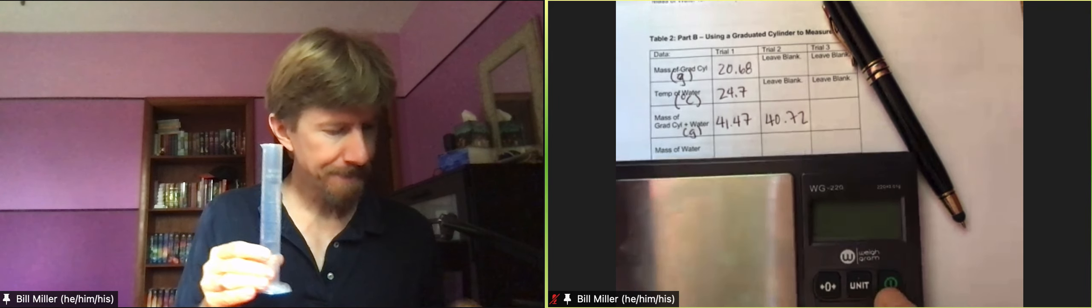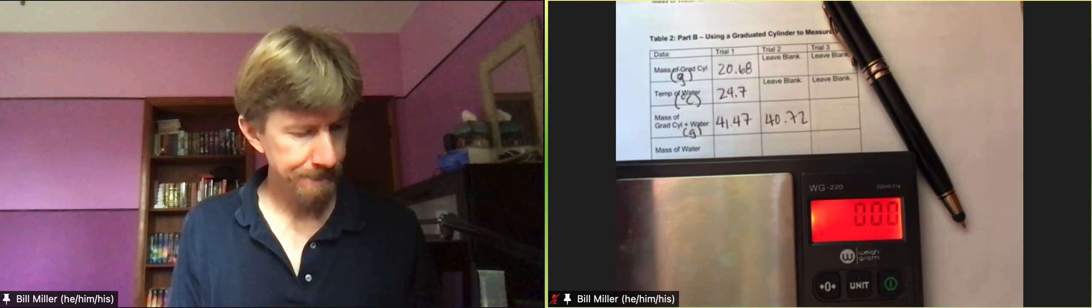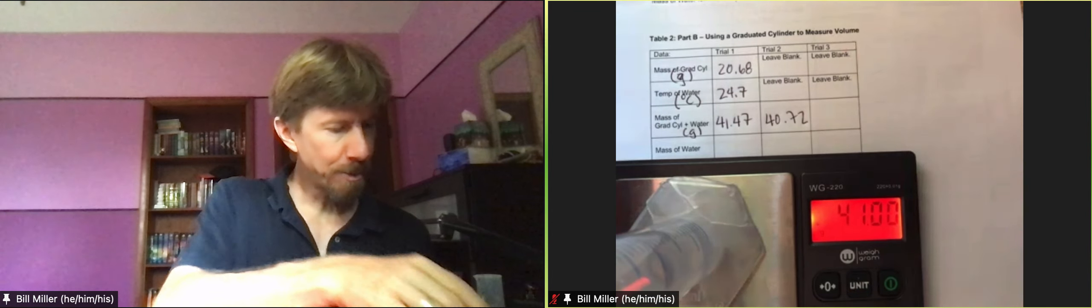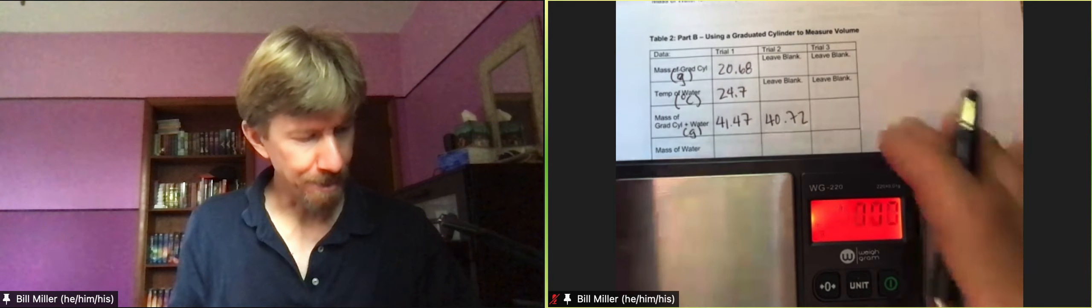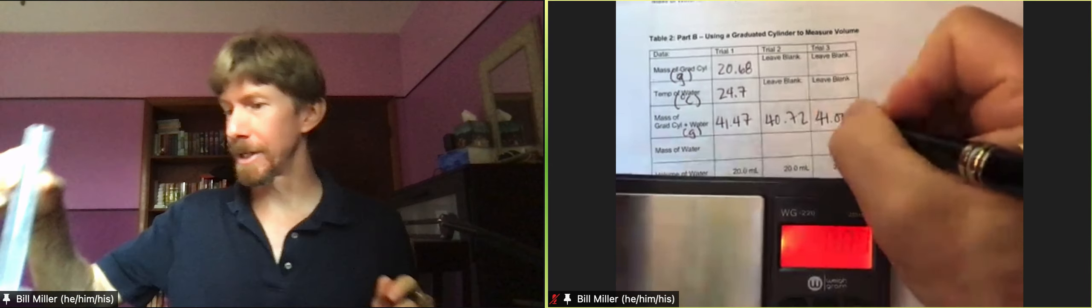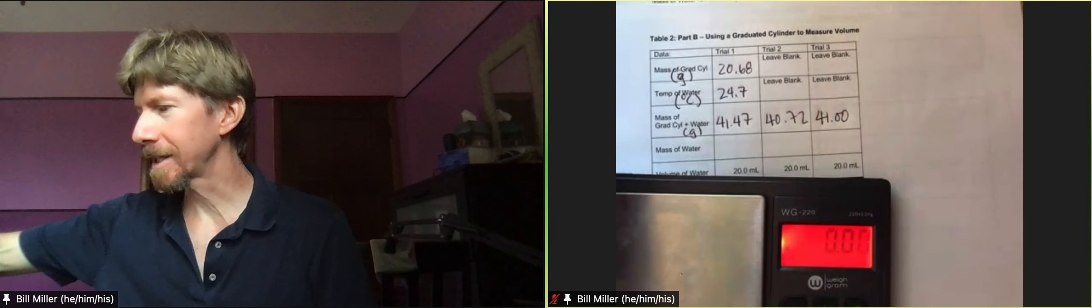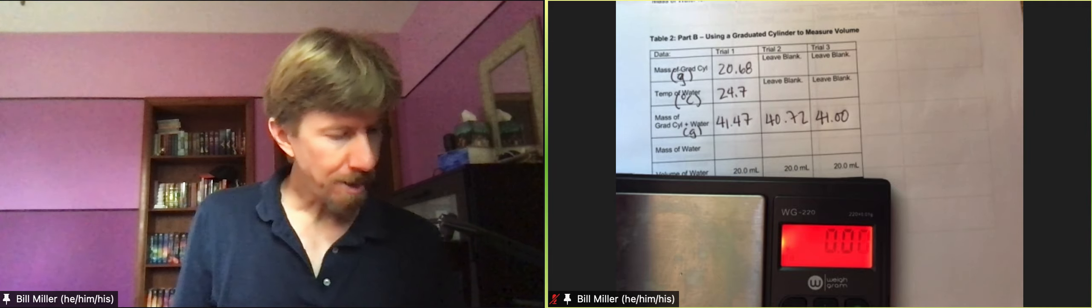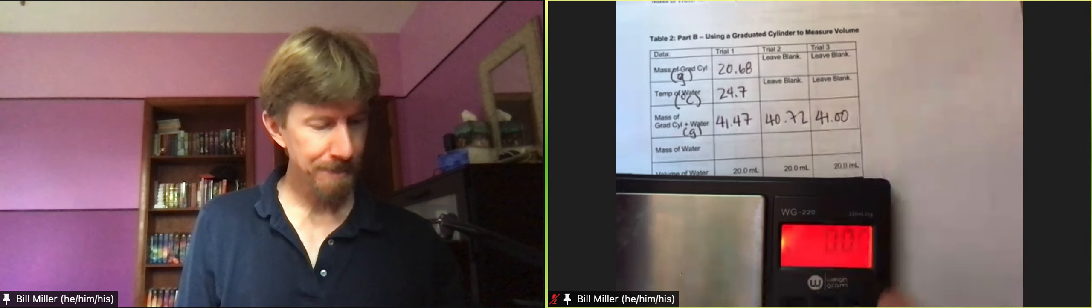Wait for the dot: 41.00, which is a good number only because it's going to make the calculations fun. You'll note that I've written down all of the decimal places no matter what, because those decimal places are significant. I know it's not 41.01, it's 41.00.